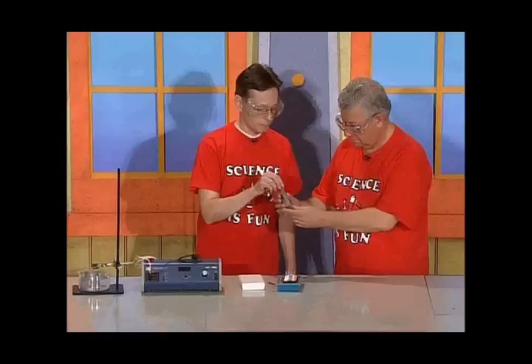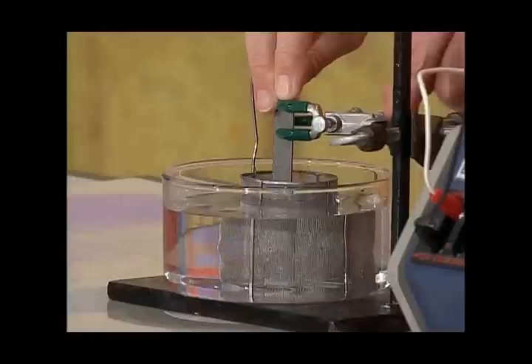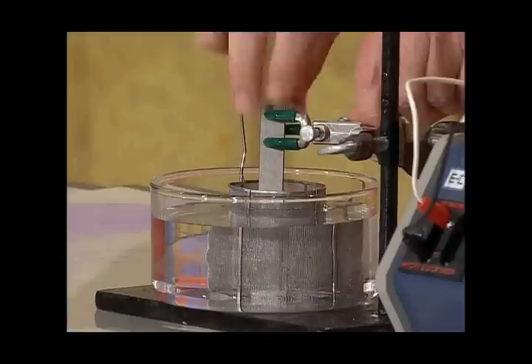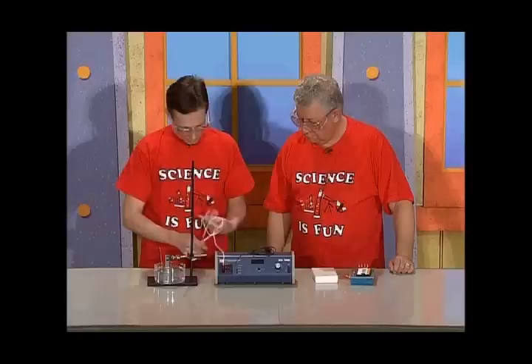All we need to do is to take that piece of niobium and put it into a liquid that conducts electricity. I have some here in this dish. And I will clamp it into the liquid like that. Then I need to pass electric current through it to put the coating on. So I will connect a direct current supply that converts AC into DC. From this box right here? This box right here, yes.